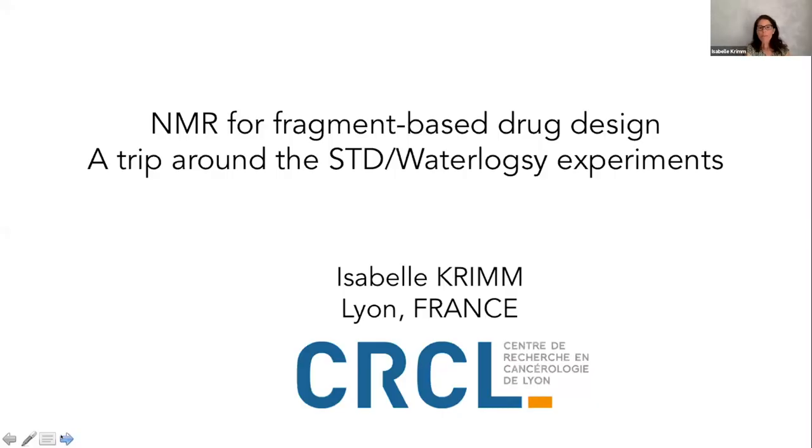I'm very happy to be here for this very special day. I really thank all the organizers for giving me this opportunity to speak a little bit about the use of NMR in fragment-based drug design. NMR is a very powerful method for fragment-based drug design. So I had to decide what I am going to speak about.